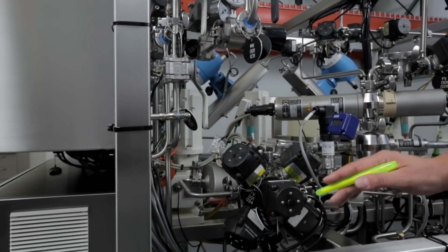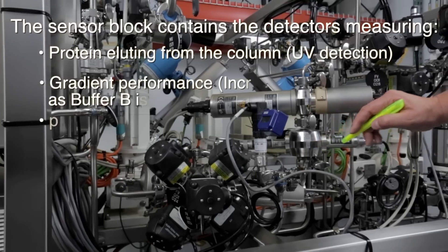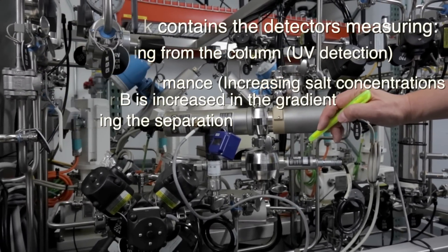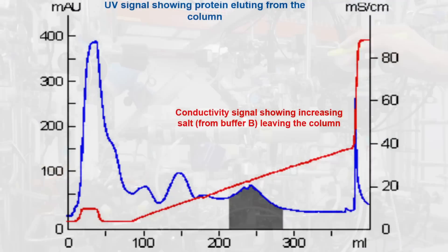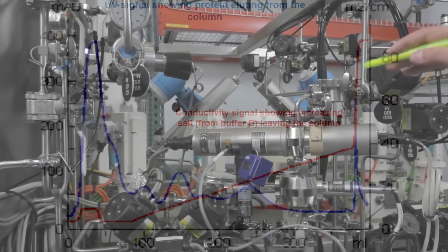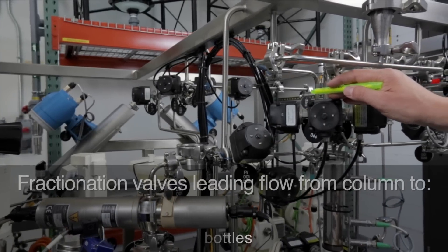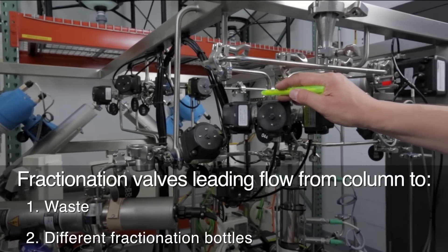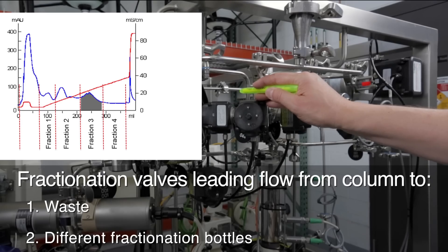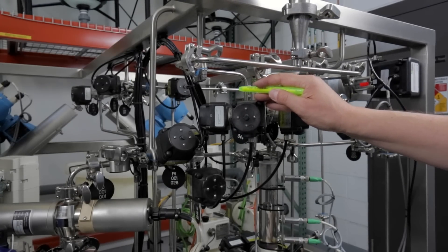Then the liquid is sent back into the piping and passes into the sensor block, where pH, conductivity, and UV absorption are measured. Now we come to the very important last part of the system: the fraction collection system. On these valves, each fraction is sent to an individual container — for example, one fraction can be the target protein.